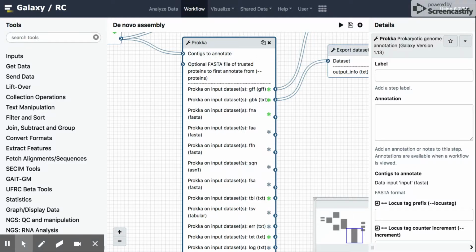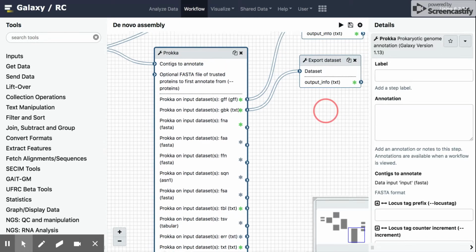Hi again. I had to cut that last video a little short because I'm limited to 10 minutes on these videos, but I just wanted to pick up a couple things and maybe go a little more into detail with a couple items in the workflow generator.